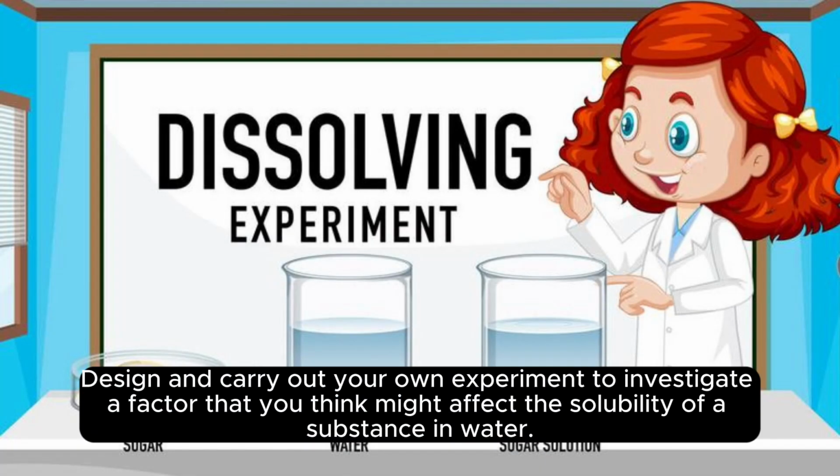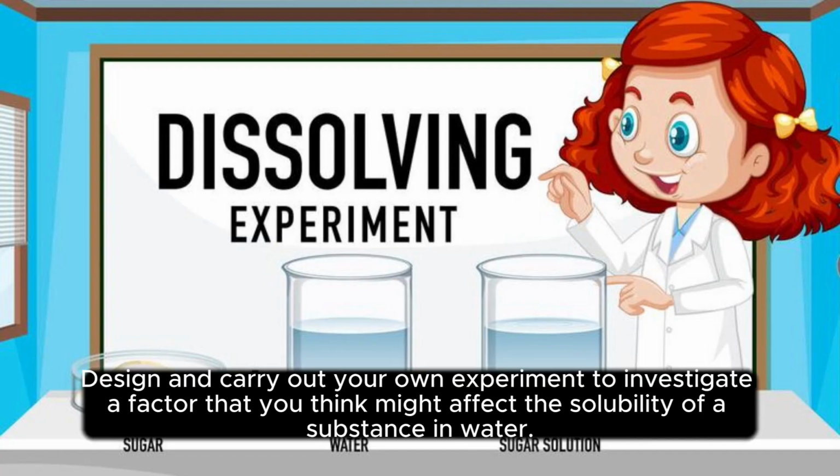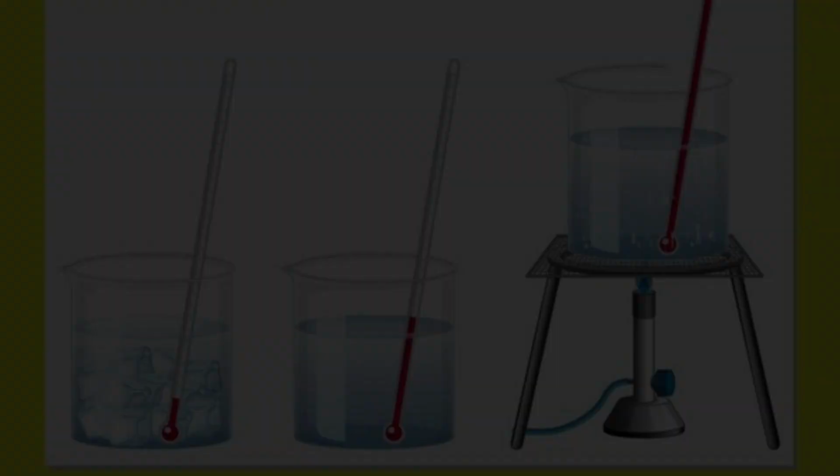Design and carry out your own experiment to investigate a factor that you think might affect the solubility of a substance in water. Teacher's notes.